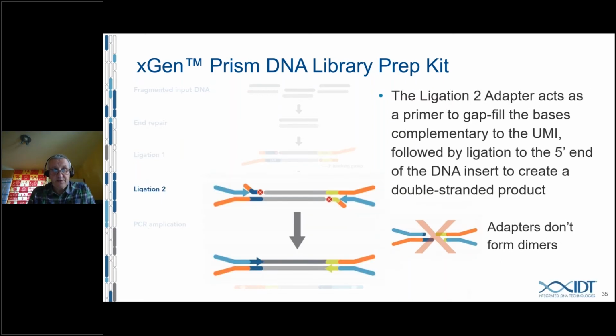In the second step of the protocol, we add a primer that is annealing to the stem structure of the longer molecule in the adapter. This primer will displace the shorter molecule of the adapter, removing it, and by such will also remove the blocking group, and the extended filled-in product can ligate to the original DNA molecules. This results in the bottom structure, which is a representation of a stubby adapter ligated onto the molecules of interest.